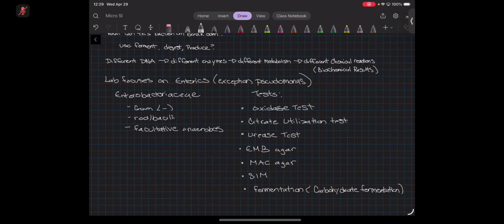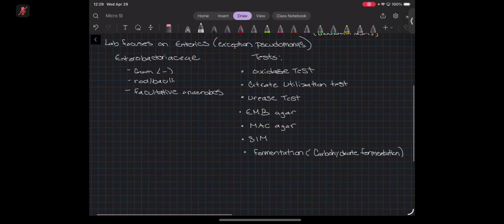Oh, the bacitracin and the optochin. Okay, so she's taking those antibiotic tests out. But you do need to know your alpha, beta, and gamma. And then the fermentation breaks up into two: the BCP glucose and BCP lactose.